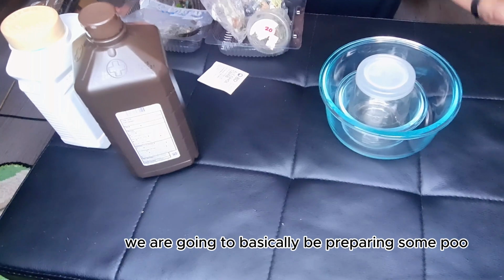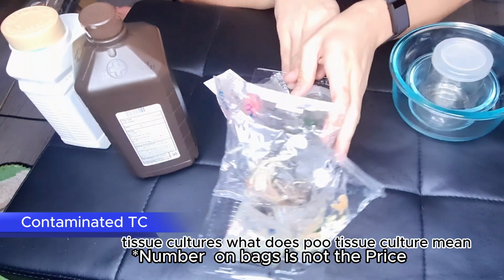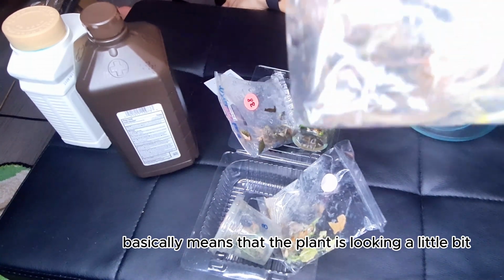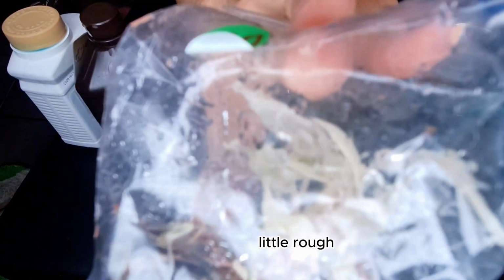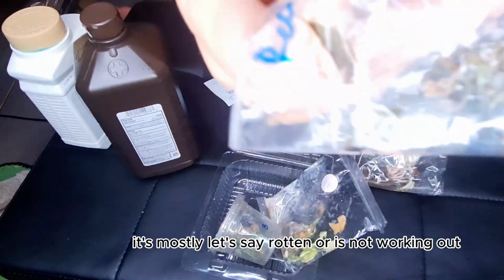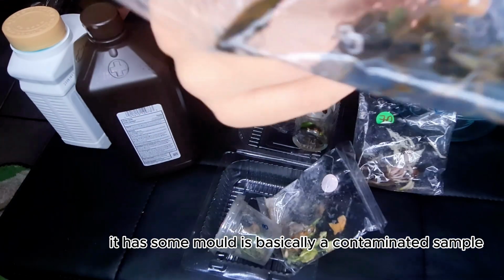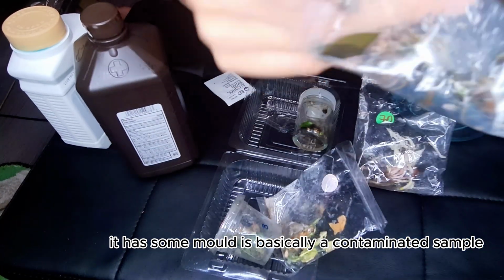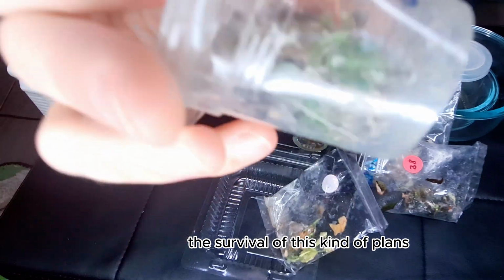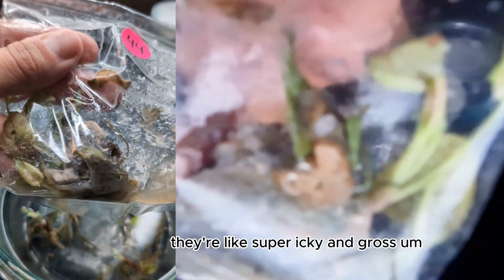We are going to basically be preparing some "poo" tissue cultures. What does "poo" tissue culture mean? It basically means that the plant is looking a little rough. So this is a really good example of it. It's mostly, let's say, rotten or it's not working out. It has some mold. It's basically a contaminated sample. The survival of this kind of plants is definitely not guaranteed. They're super icky and gross.